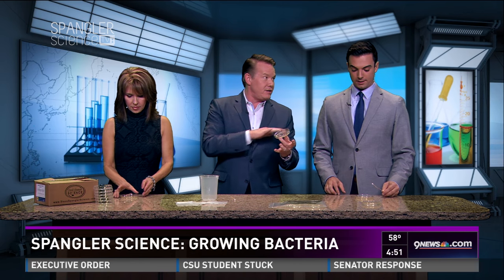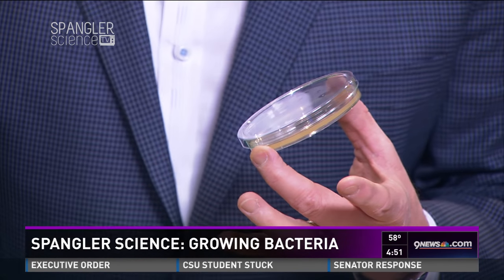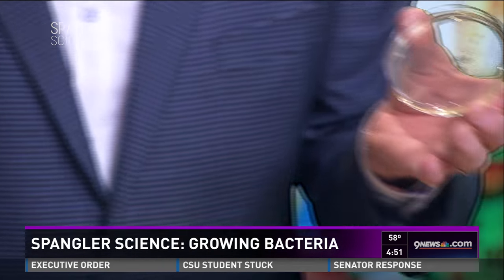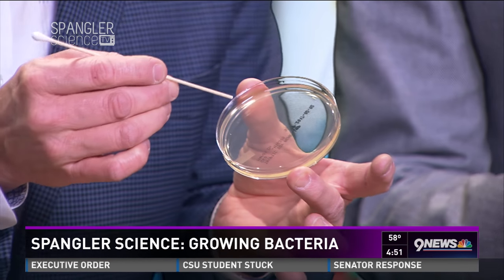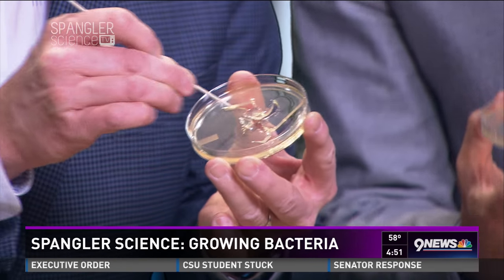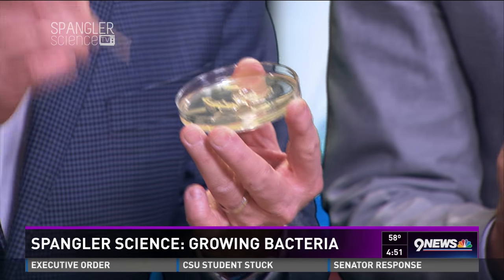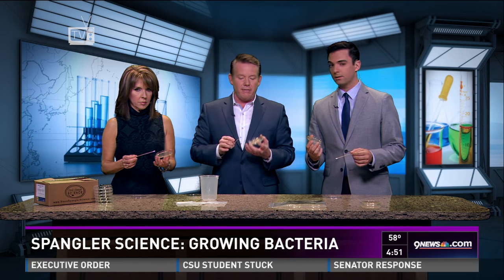These dishes are perfectly fine — brand new. No super bugs or anything. So you put the top to the side. There's actually agar inside here. You're not ever supposed to do this, but I'm going to show you what it looks like — see how I'm moving it around? I've always shown you the results, but I've never shown you the process of making one of these. When a kid gets a bacteria growing kit, I want to show you the whole process.